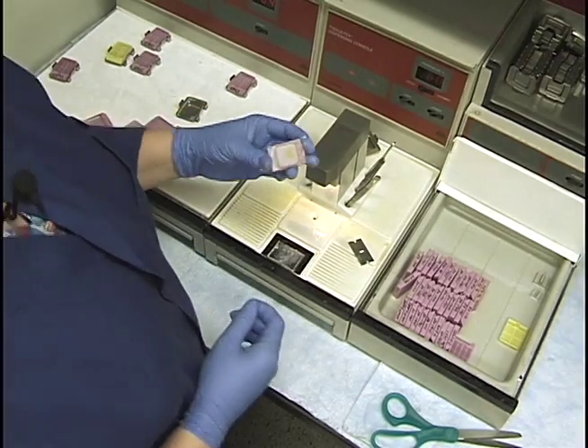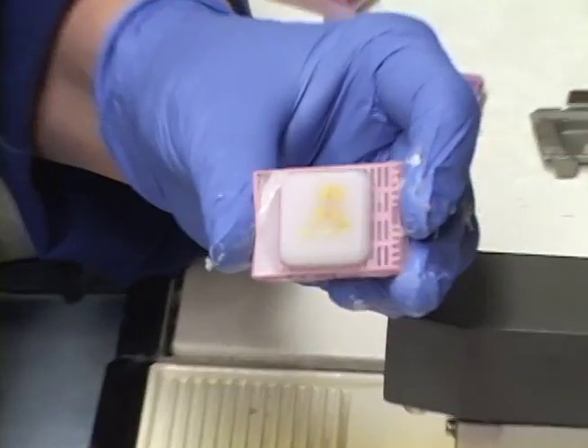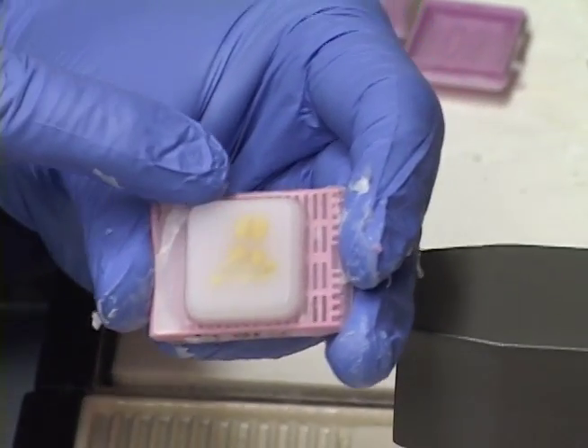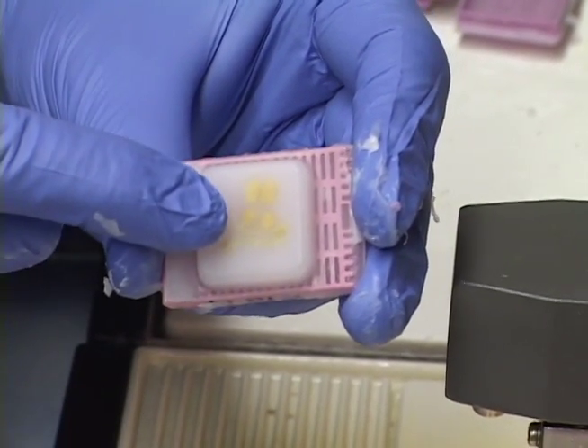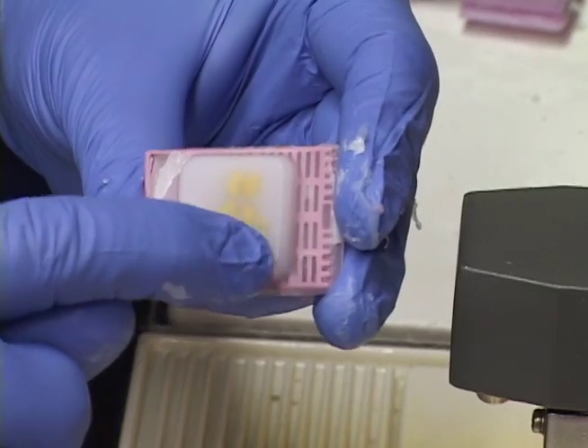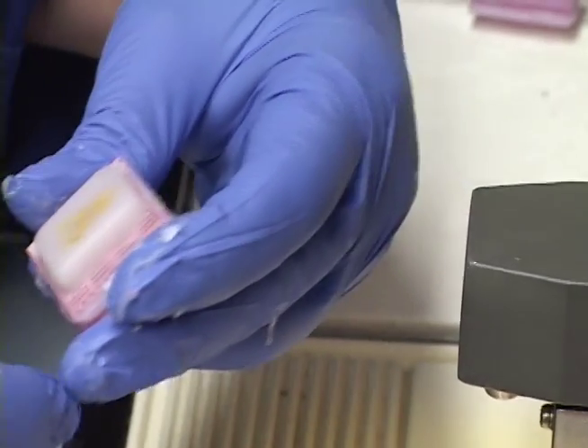Here's the final block. This is how the Jameson Lab does our ENU tissue — here's the longitudinal where I cut the whole testes in half, here are the cross sections, and here is the epididymis. They're nicely and evenly embedded.